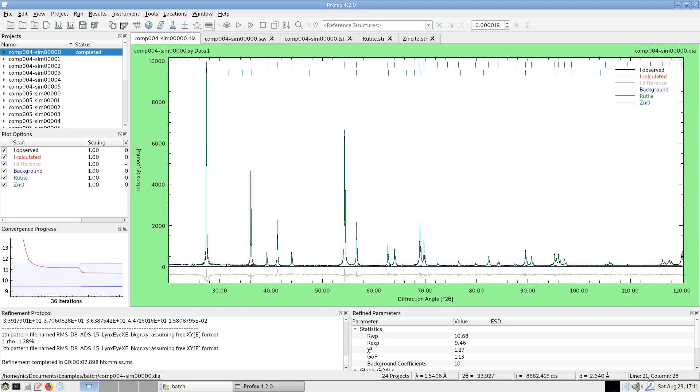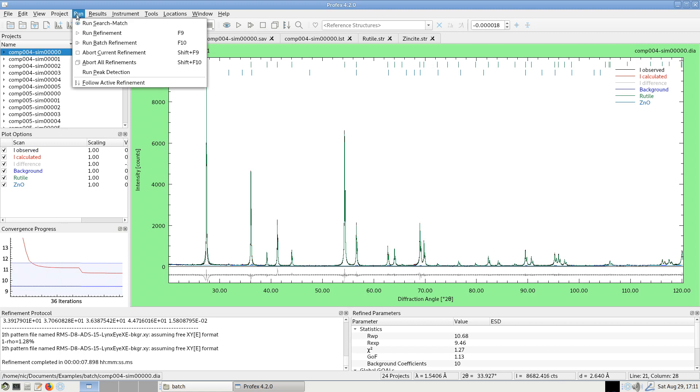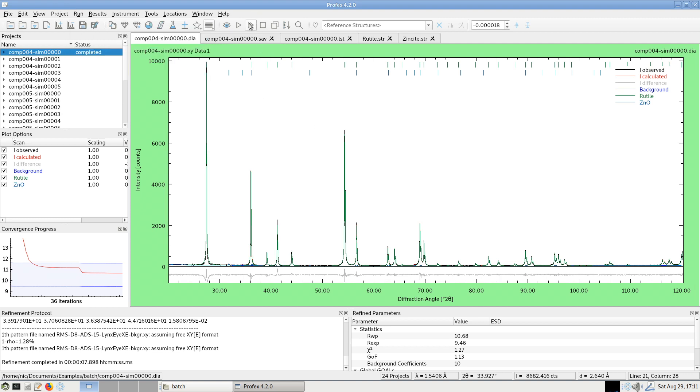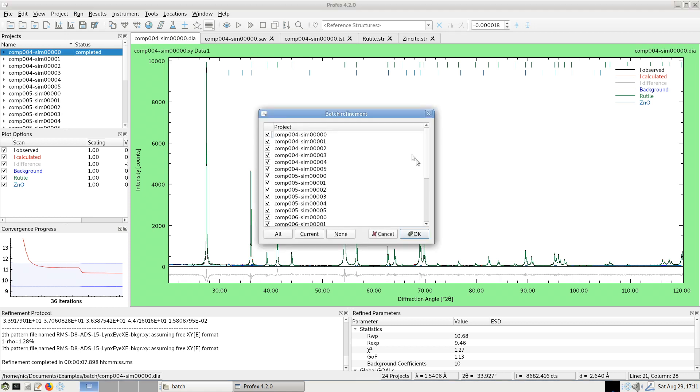So now all I have to do is run a batch refinement, either from the run menu, run batch refinement, or click the F10 key on the keyboard, or click the fast forward looking button here in the menu bar. It will again ask which projects do I want to refine in the batch. And again, I have the quick selection buttons.